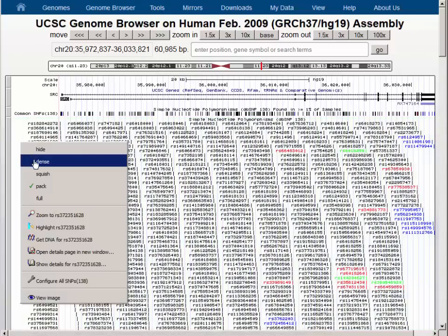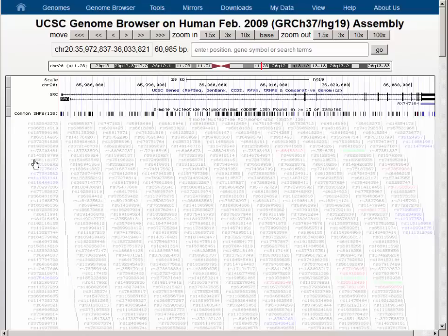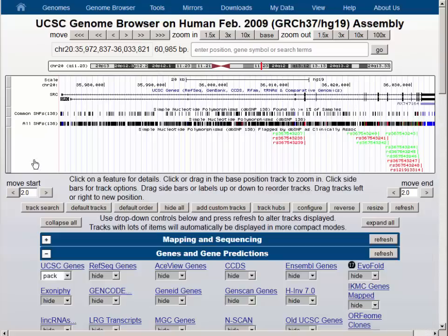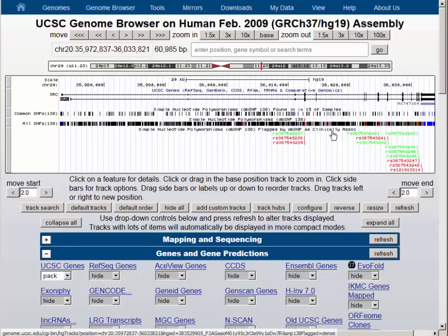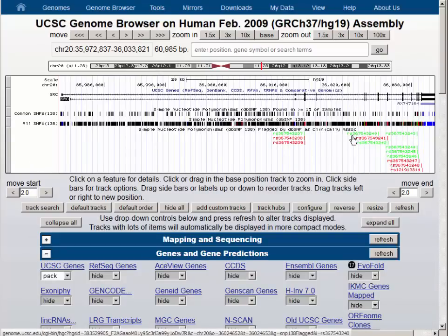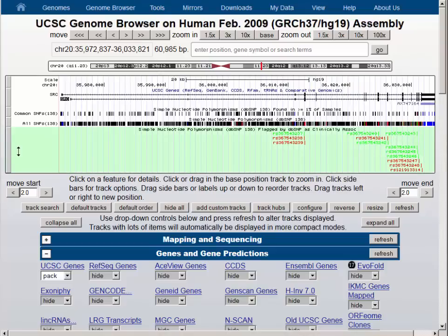The all SNPs track is considerably denser than the common SNPs track, as you would expect. The clinically relevant SNPs also include some green ones, which are coding region SNPs that have no change in amino acid.